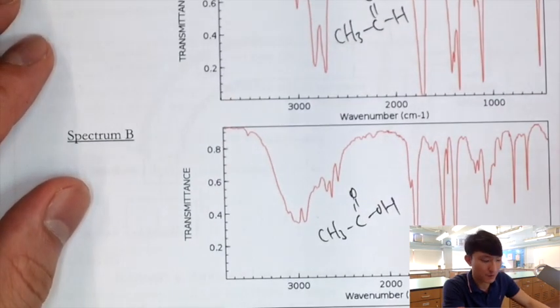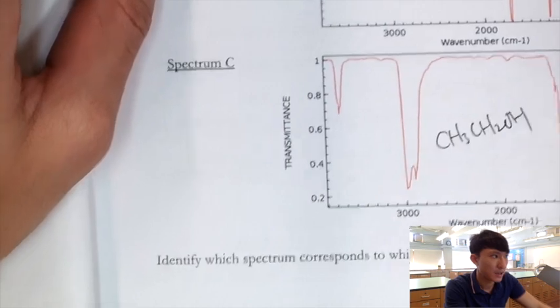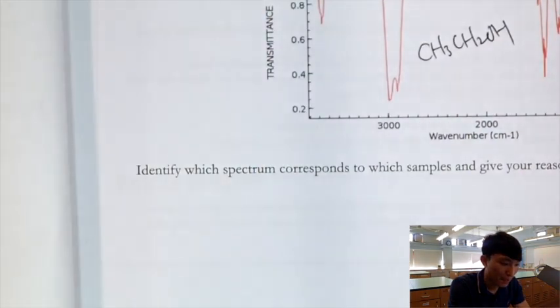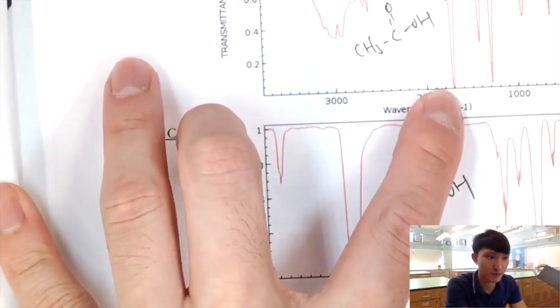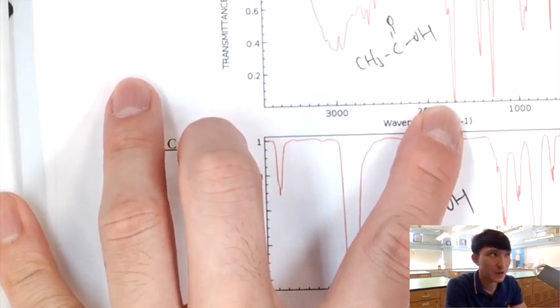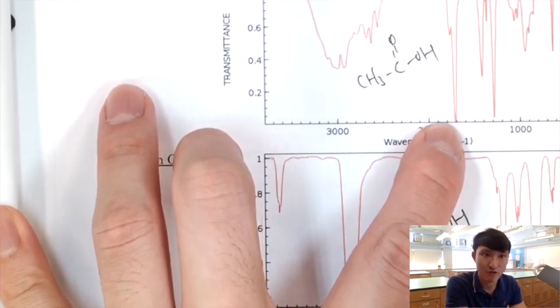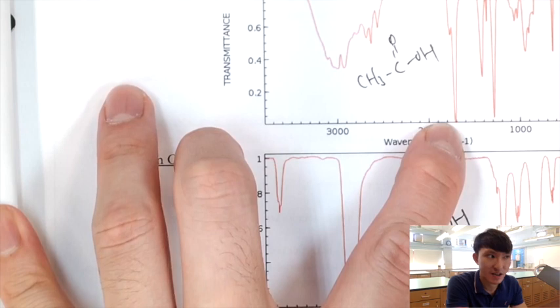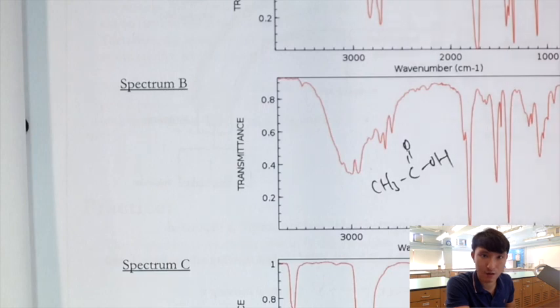But for the reasoning, how do we put down the reason for that? So now this one is very important, guys. Of course, if we see the presence of a peak, you can tell the presence of a bond or functional group. But there is one more very important technique: if we cannot find a peak at a particular region, range, or wave number, it also provides very valuable information regarding the structure, right? And just now, I used the absence of a peak to make our deduction.